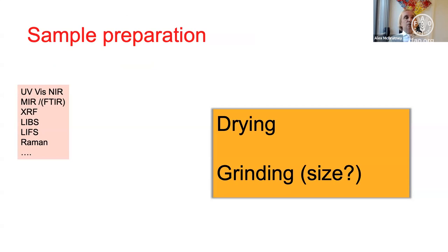I think these are two issues that need to be systematically experimented on for all of these different new kinds of spectroscopy, because we think that these other methods will also add information in generating soil information. And of course, the advantage of spectroscopy is once you prepare the sample, it's non-destructive, except for LIBS. LIBS has obviously got a bit of destructiveness to it. You can put it in other spectrometers and get further information. Next slide, please.